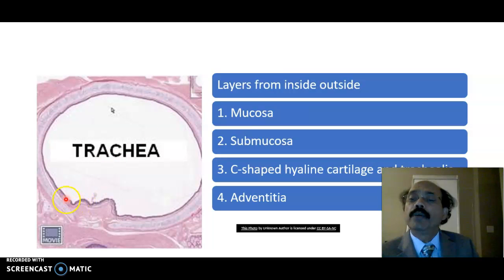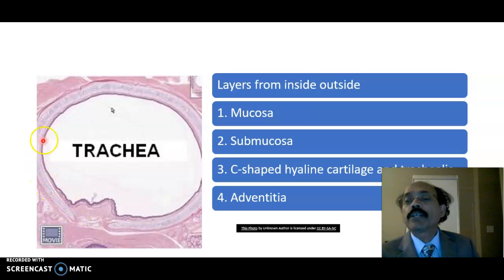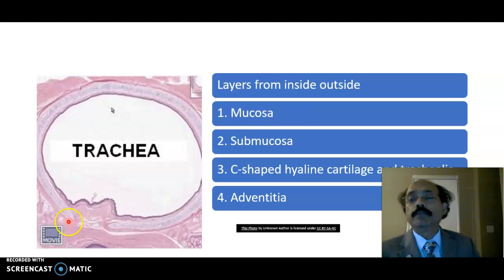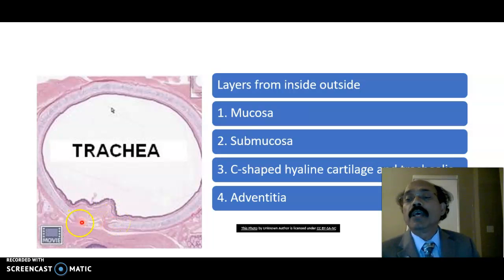So again: this is the mucosa, underneath we will get the submucosa, then we will get the C-shaped cartilage. The gap at the posterior part of the C-shaped cartilage is covered by the smooth muscle called the trachealis muscle. And outside the C-shaped cartilage we have the adventitia.